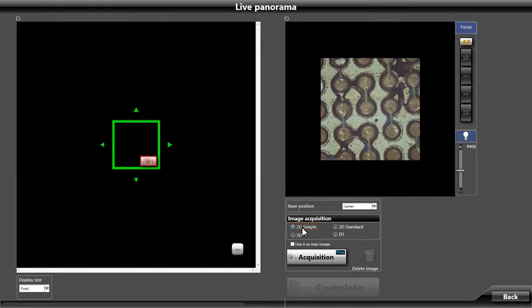Next, we will need to click on the camera icon to begin acquiring a live image in the single field of view.